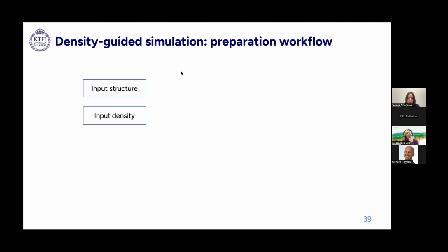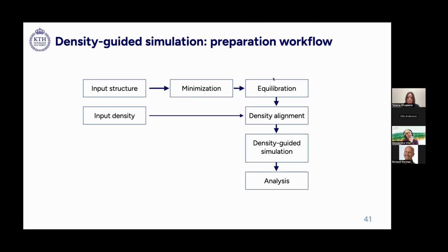If we move further, I have a tutorial pipeline here. For the input structure, we will first do minimization, then equilibration. After equilibration, we will align the density to the equilibrated system. And after that, we will be able to start density-guided simulation and analysis.